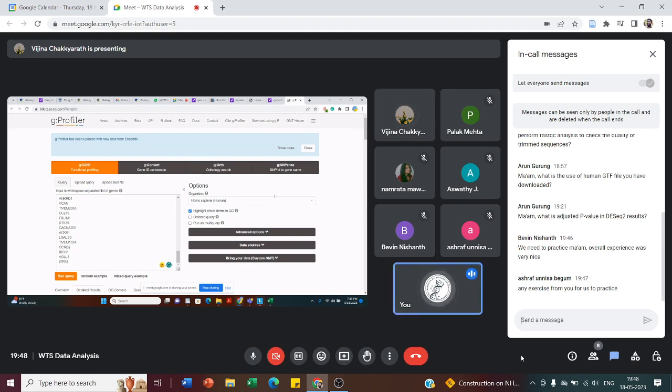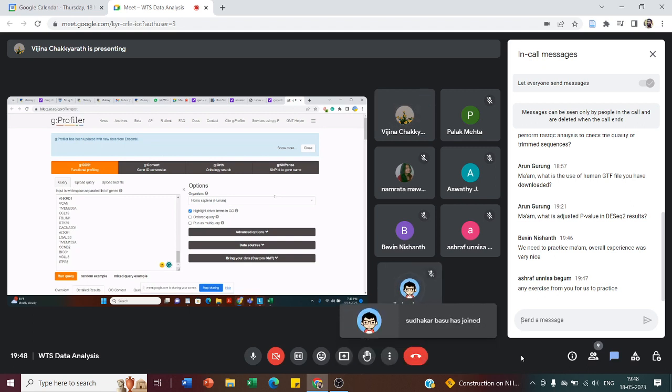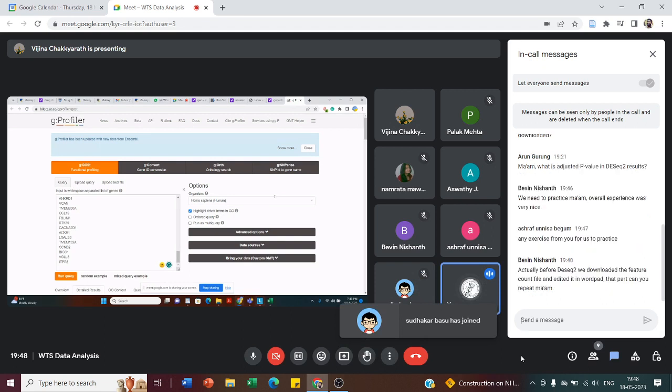Okay, let us wind up the program. Yes. If any more questions, we can. As one comment came, actually before DESeq2, we downloaded the featureCounts file and edited it in WordPad. That part, can you repeat, ma'am?